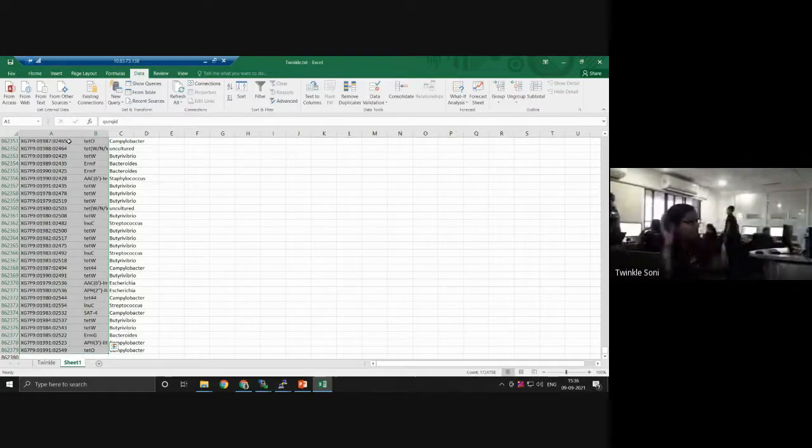It will be too long to drag it down. See, even with this much stringent parameter, we obtain such high entries for a sample. If you keep the parameter low, then entries will be more, so it will be more difficult for you to analyze.